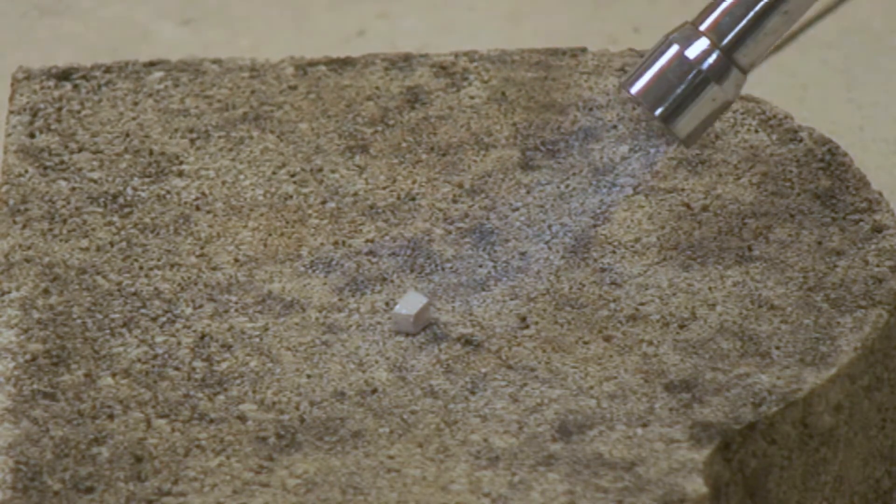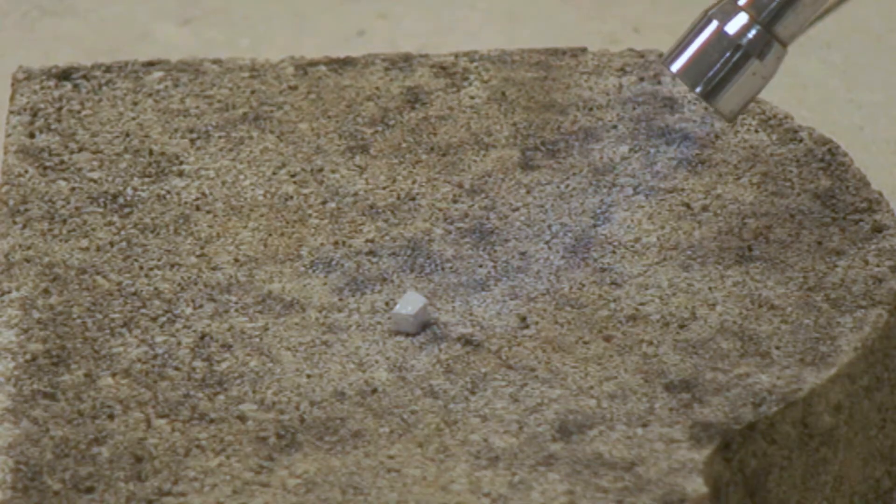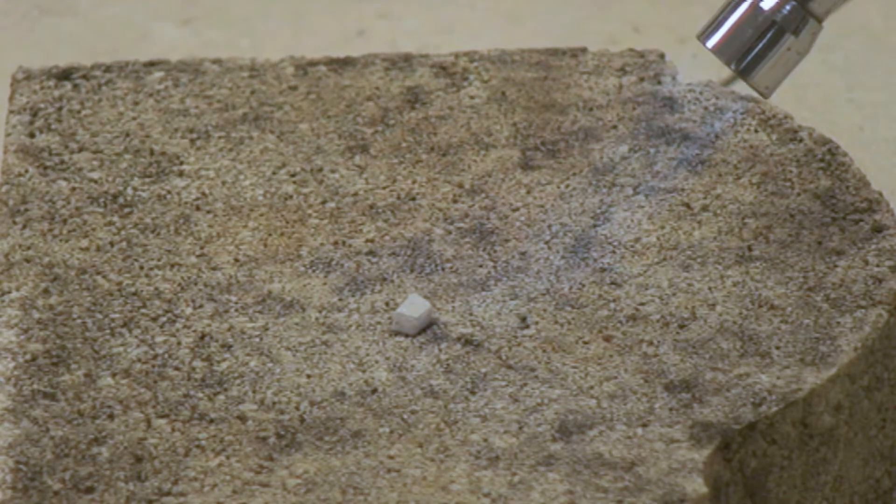We placed a piece of sodium on a concrete slab and pointed a Bunsen burner flame at it. The Bunsen flame is over 500 degrees Celsius and yet, at least to start with, nothing happens.